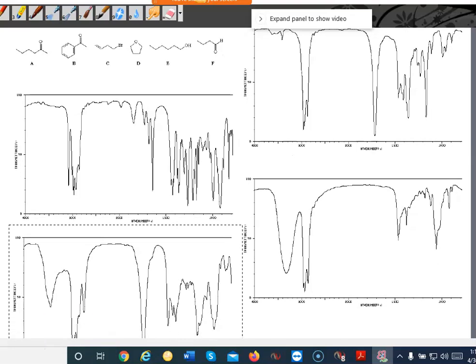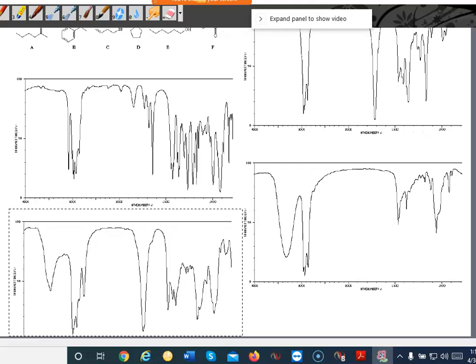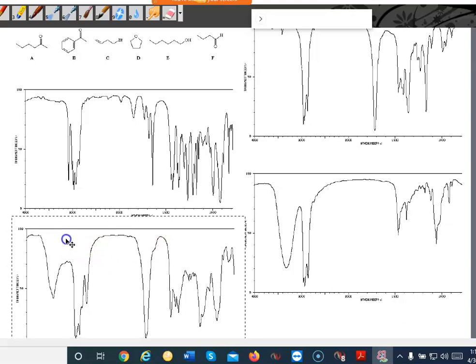Let's see if we can do this now. So you guys see everything? Yeah, use the scale above it. I know the scale on this one is chopped off, but I think the scale matches up perfectly. So like 3,000 here. There's also 3,000 right under here. Here's 2,000.